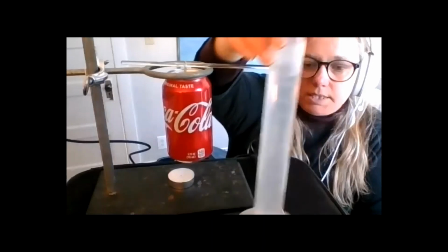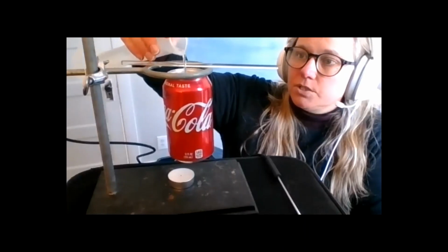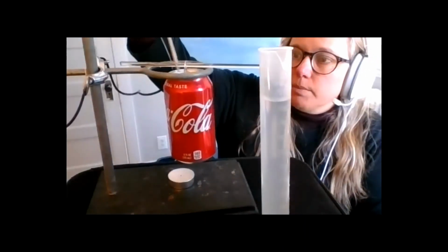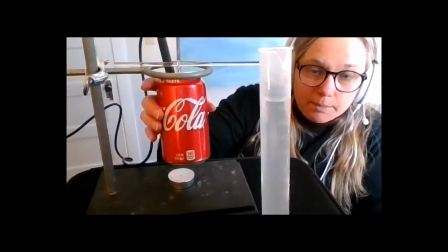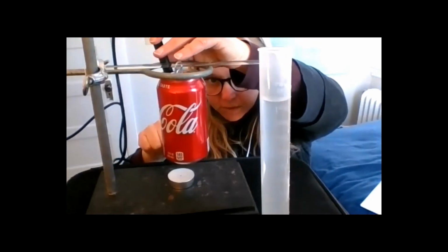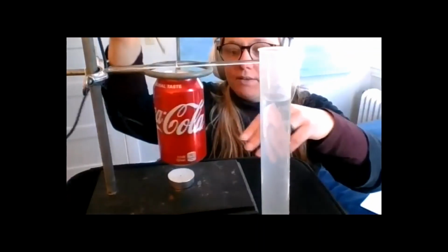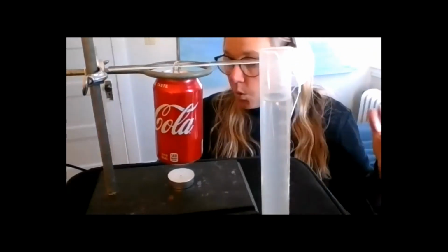Figure out a way to cool it down. And once you get the cooled water, then you're going to be putting your cooled water into your can. And then you're going to put your thermometer into the can and get a cold water temperature. And then once you got all that cold water temperature figured out, then you light your candle and heat it up until it's at the goal temperature.